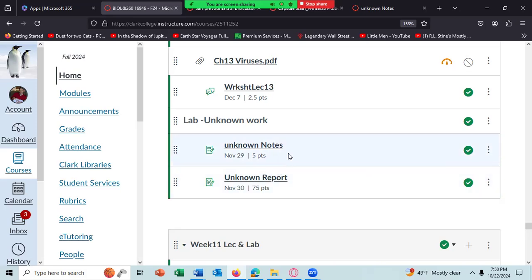Any question about any of that? For the notes on the timeline, in terms of the three tests that you're going to give us, you said tonight the gelatin test is performed, correct? Yes, and it takes a week. Okay, perfect. And then Sunday the Gram stain will be started, and Monday the PR lactose test will be started. Yes. Thank you so much. All right. Any other questions?